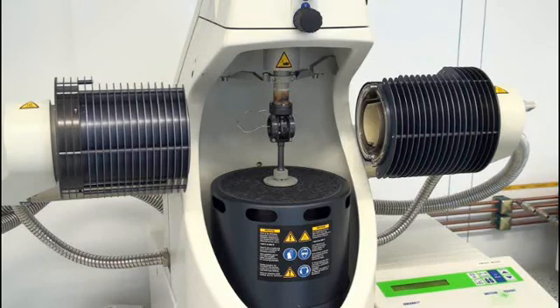But this is not all. Not only can we open the furnace to access the clamping assembly, but the whole design is dedicated to ease of use.